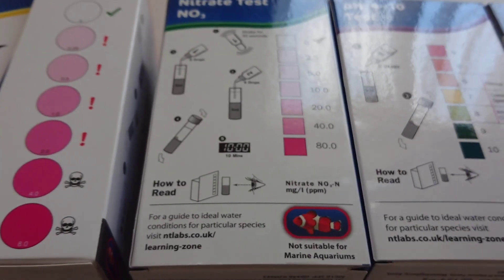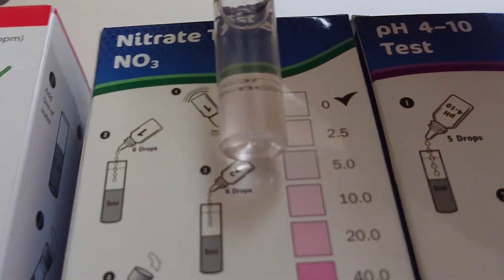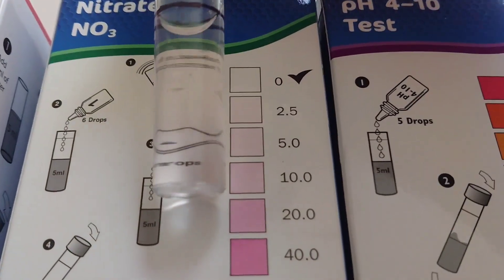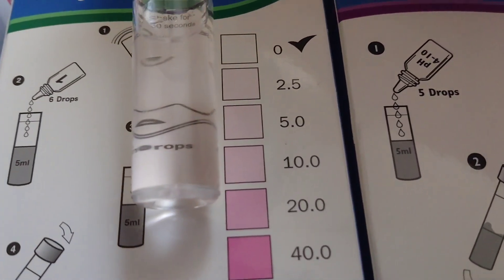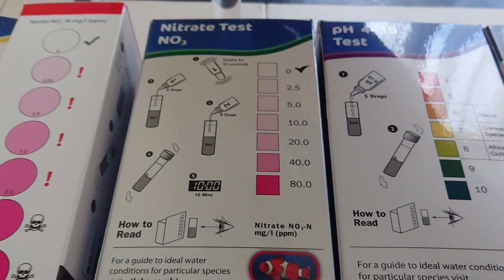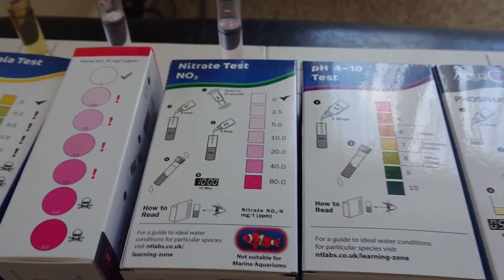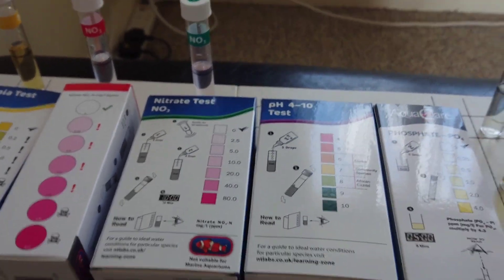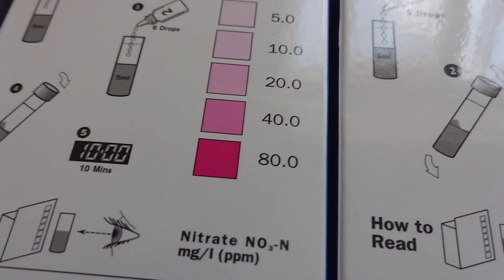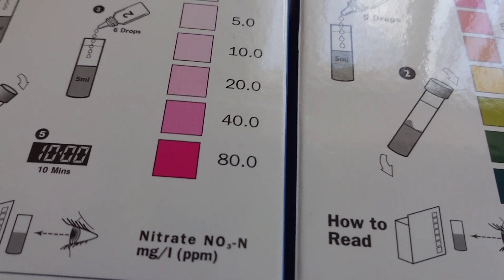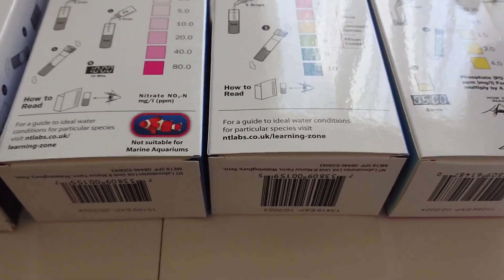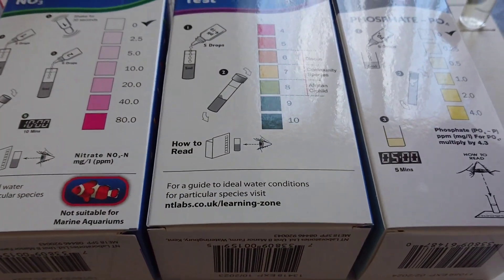So let's have a look at nitrate. I'd probably call that five. Nitrate is apparently only deadly in quite high quantities. I think they normally say if it's 40 or over, then you want to take action, but anything lower than that is fine.